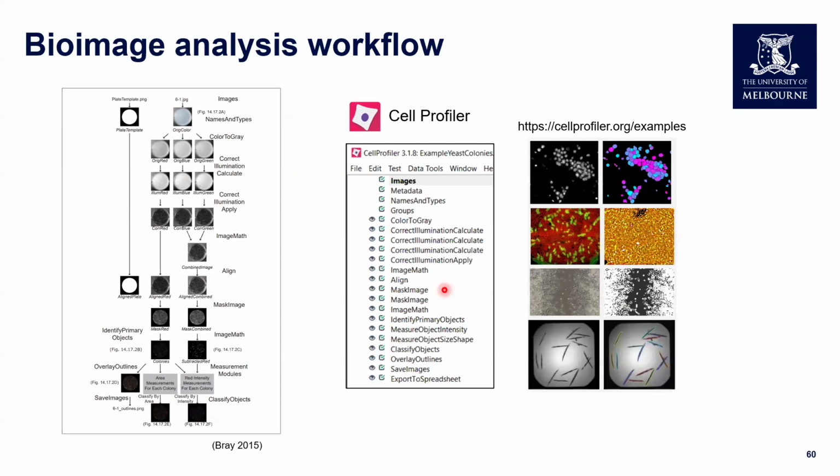On the CellProfiler website, they also provide templates of many example applications, and some of them are already shown in the previous pages. These are really helpful for understanding different types of workflow. So I recommend you go and check it out.